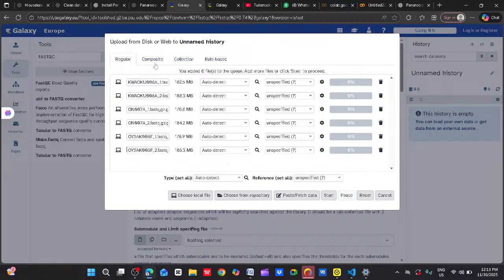It is expected that, because the locations are four different locations, we are going to have three. Okay, it is three. One is still pending, and that is the one from Ekiti.